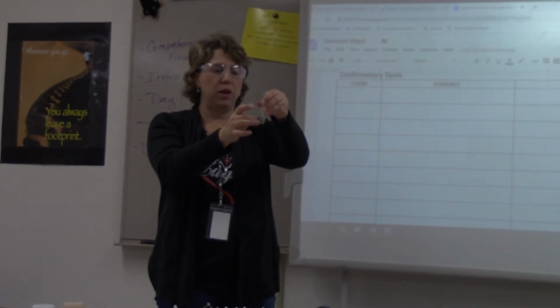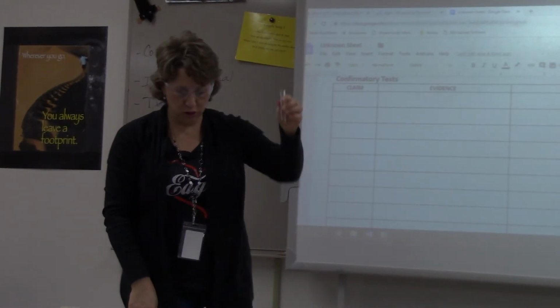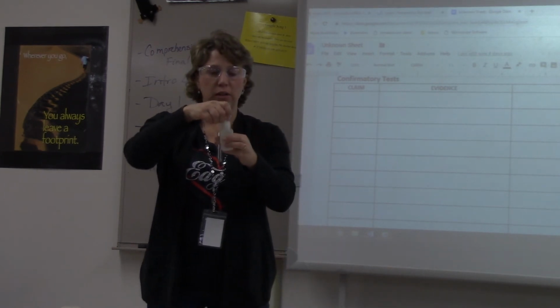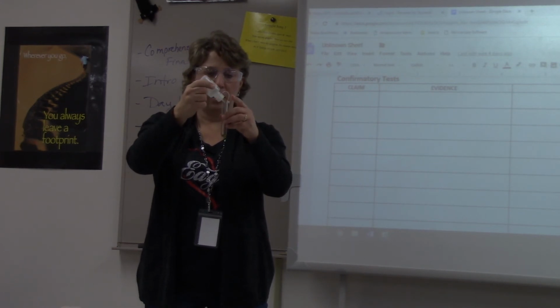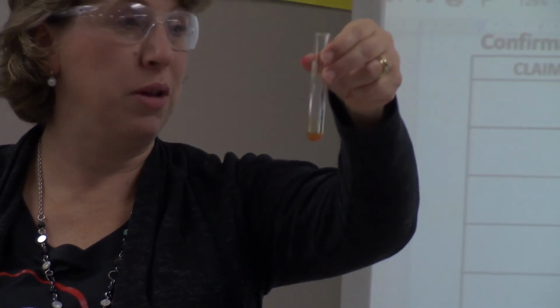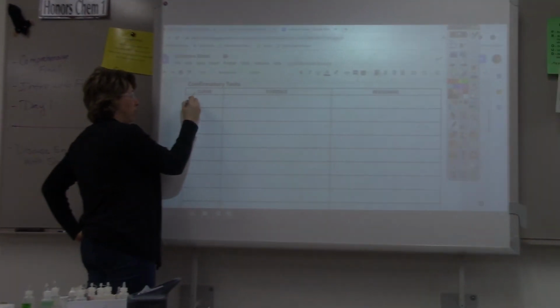Colored compounds, by the way, make colored solutions, and so obviously I have a nice orangish yellow solution for my iron. And now I'm looking for ammonium hydroxide. So I found ammonium hydroxide, and I am going to see if it also forms, and notice, does it also have a red gelatinous PPT? Yes. And so at this point on my claim, I'm claiming that I have iron 3.